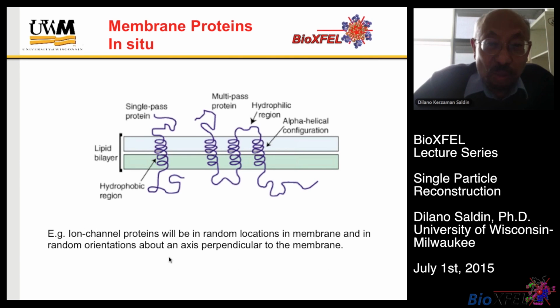Now, before I go on, I want to illustrate the technique with a two-dimensional example. So a two-dimensional example would be a membrane protein in a membrane. Now, often membrane proteins have a hydrophobic part which lies within the membrane, and hydrophilic parts which lie outside the membrane in a real cell.